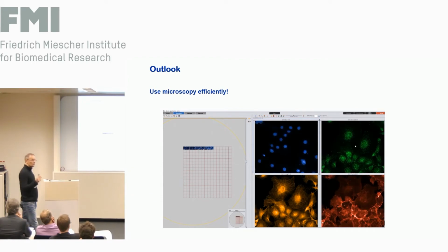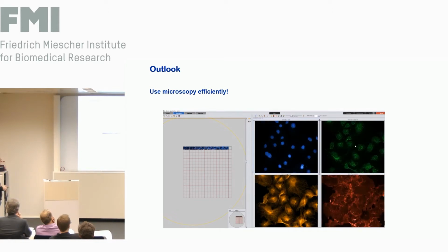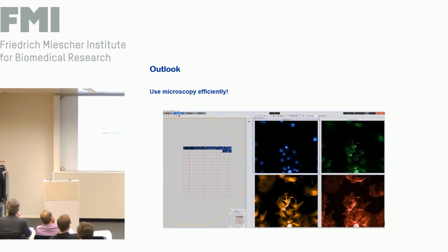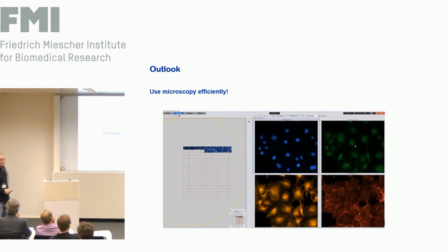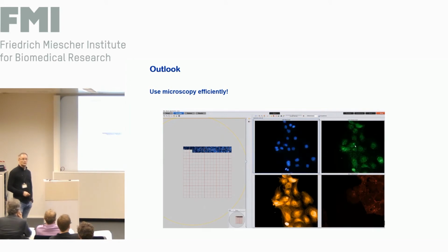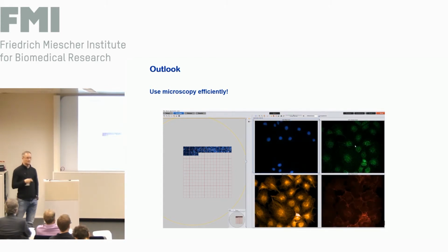What we realized, we have more and more high-speed imaging systems generating just normal wide field images, for example, and instead of searching manually around, we just image a whole cover slip. It's much more efficient for a user not sitting in front of a microscope. An additional advantage of these microscopes is they find the focus independently of the user. It's much more precise, and they are obviously much more rapid, generating a lot of data, which is actually very difficult to analyze and view.